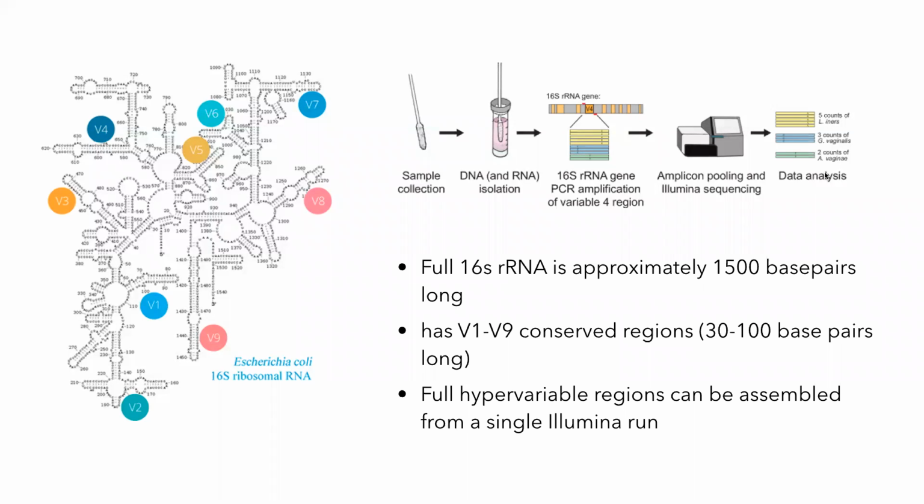Now, another thing, so I see here some discussions about primers, and so all of that falls under the category of library preparation. So all of this discussion up until now is really about sample extraction and library preparation. Just to give you a little more detail about that, some of the kits that are typically used are MoBio DNA extraction kit, QIAGEN DNA microbiome kit, and there is a number of other kits that are specifically designed to extract this type of material from your raw material.